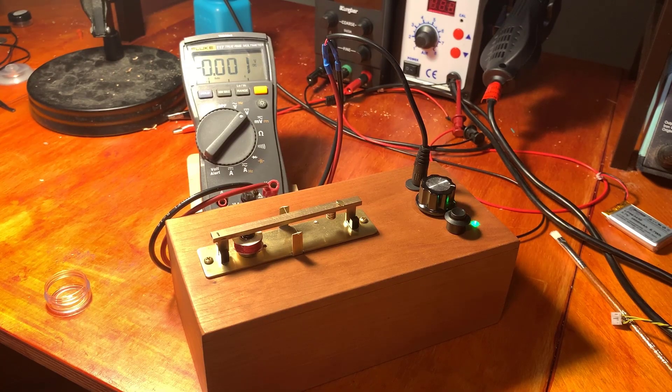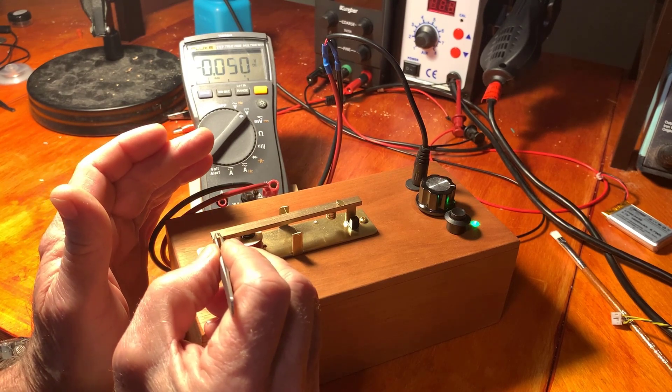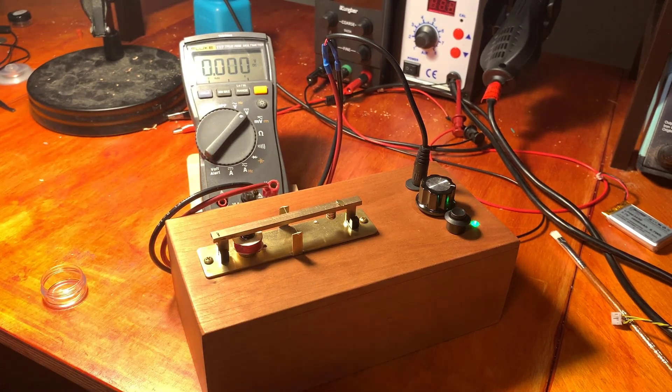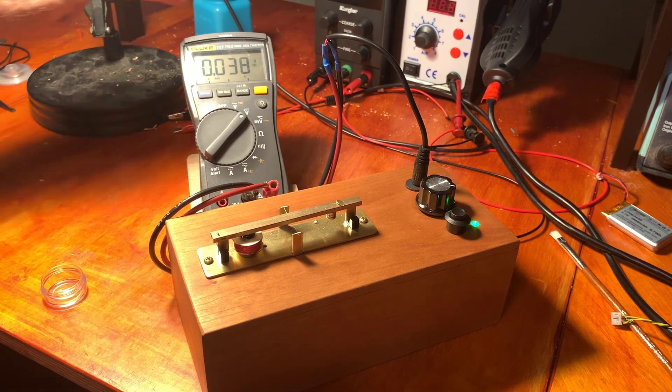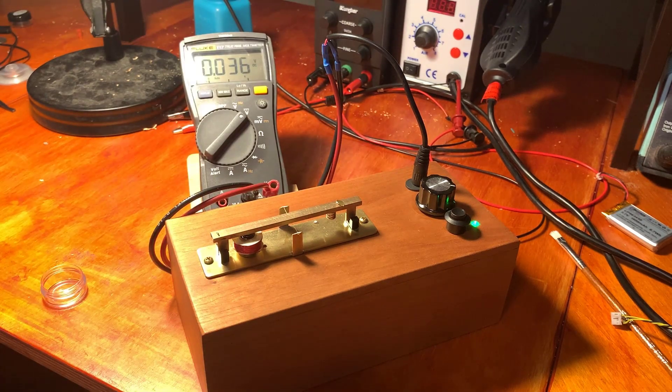I'm going to weigh that little bead on this analytical balance. The way I've got it set up, I multiply the reading by 20 and that's in micrograms. I'll call it 0.74 — so 0.74 milligrams.